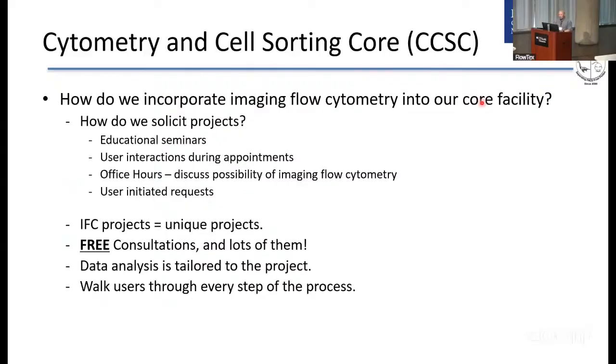All right, so how do we even solicit potential projects for imaging flow cytometry? Imaging flow cytometry is kind of like the ugly duckling in your core. It's the instrument that sits in the corner, gathers dust, gets turned on every now and then for QC, but rarely actually gets used. So how do we get interest in exploring this technology? We hold educational seminars, user group meetings, webinars. I've worked with a lot of you in this room to organize those, to bring awareness to the technology in our institution and in TMC.